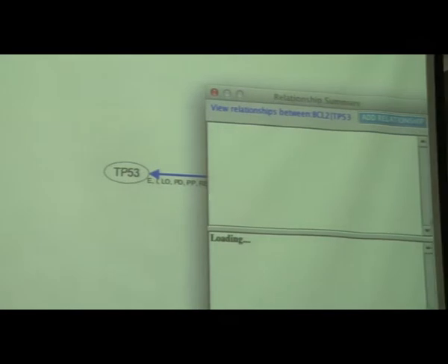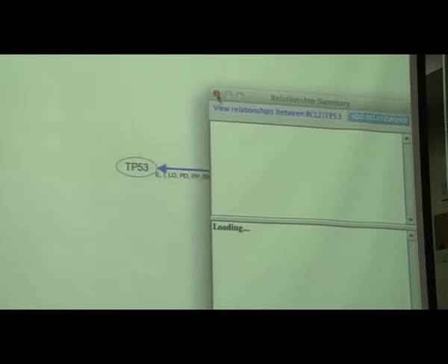And you see, we have here multiple types of interaction between these two proteins and these two genes. So if you would like to know more, just click on it, and you're going to see all the description.